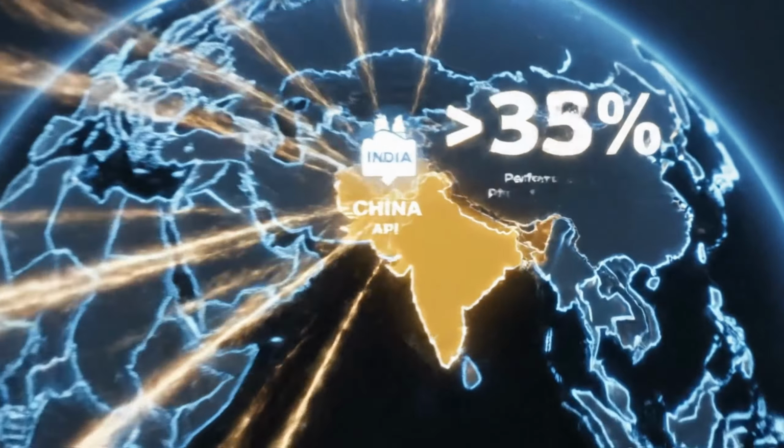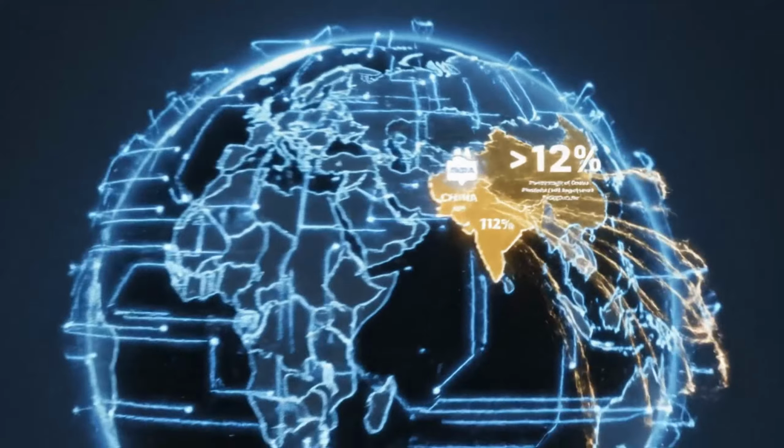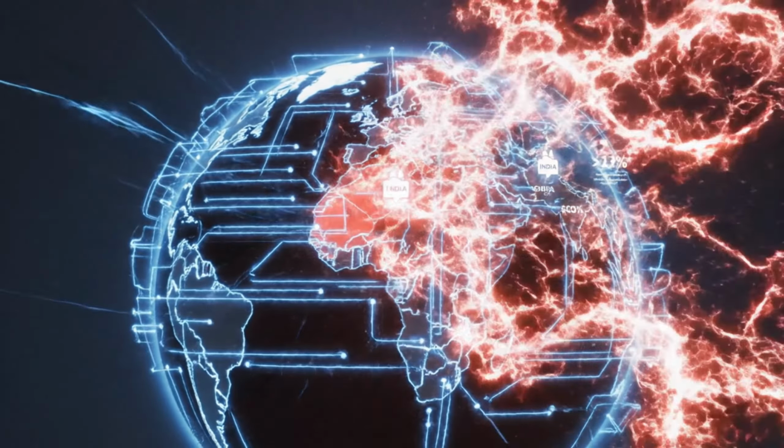India and China are now the world's largest producers of active pharmaceutical ingredients, supplying raw materials. The future of pharmaceutical manufacturing is continuous manufacturing, moving away from large batch processes toward continuous integrated production. People take a tablet and they think nothing of it. They have no idea what went into making it. Years of formulation development, hundreds of process runs during scale-up.